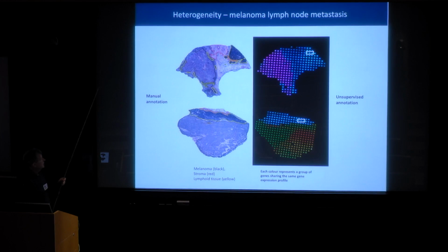And this is how that could look. As a positive control, you could look for lymphoid tissue here. You see that it's a light blue color, and you can see the same light blue in both samples, which is a good feeling. We are on track here.